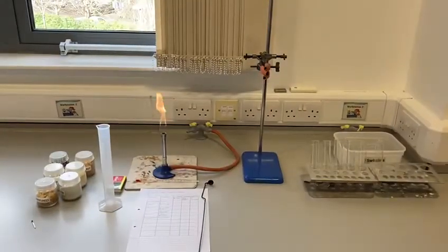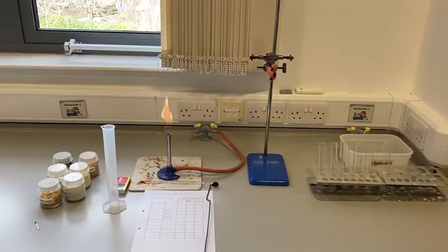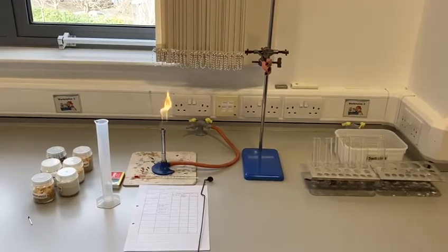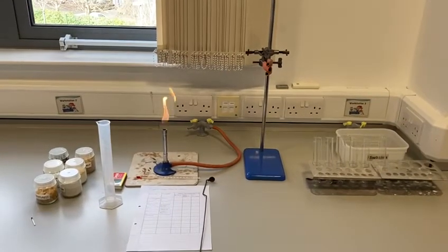Apparatus required for today's investigation includes different types of food, a measuring cylinder, Bunsen burner, heatproof mat, thermometer, clamp stand, and a selection of boiling tubes. Today we also need to use a deflagrating spoon to hold each of the food contents as we burn them.